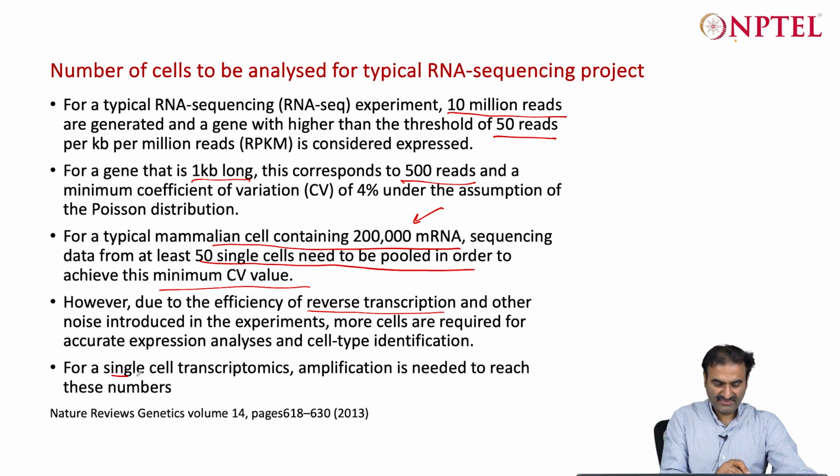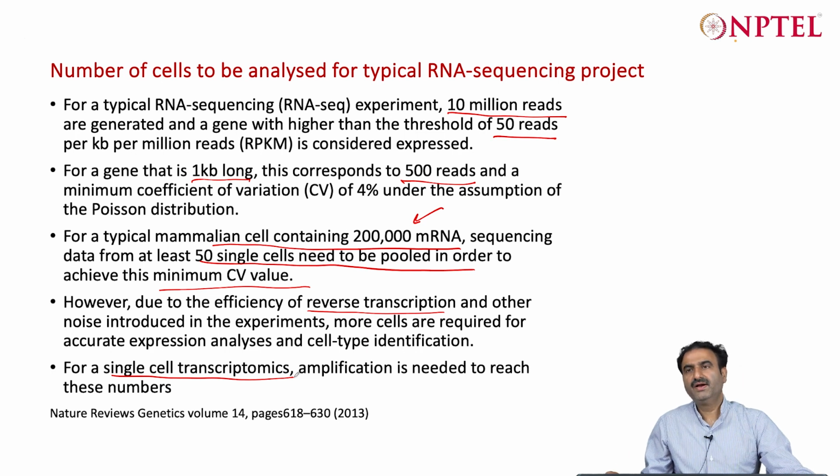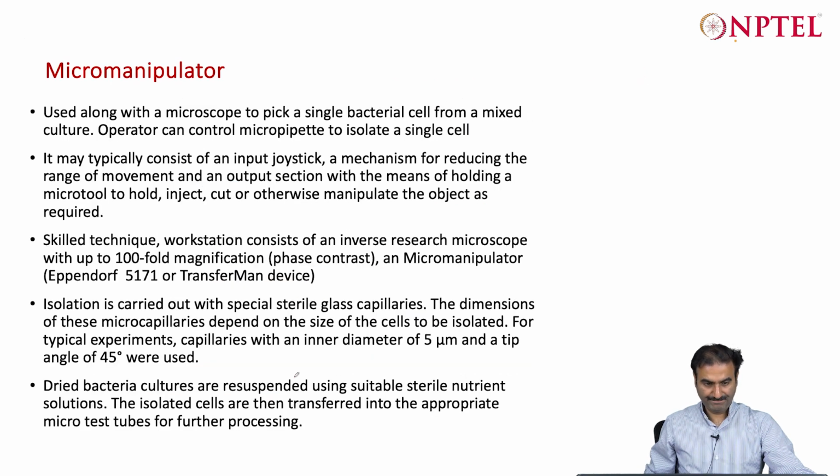And basically for a single cell transcriptome, if you want to do it, so this was for the tissue if you see. For the single cell, basically you need to follow the amplification step, like in case of the chromium instrument also, which we will see later.